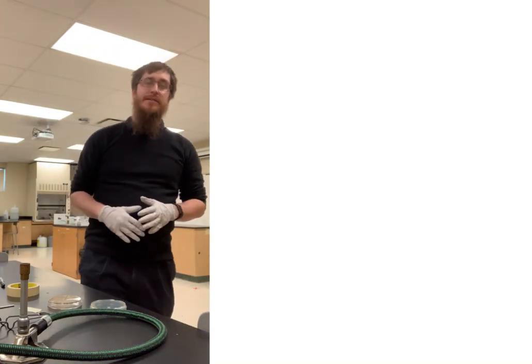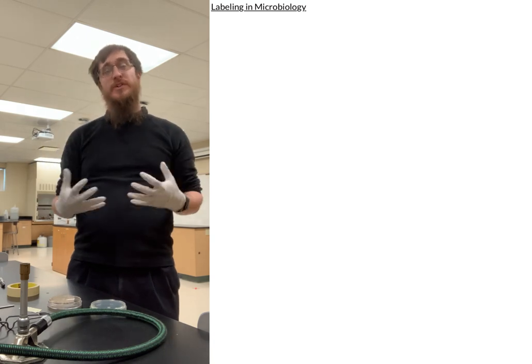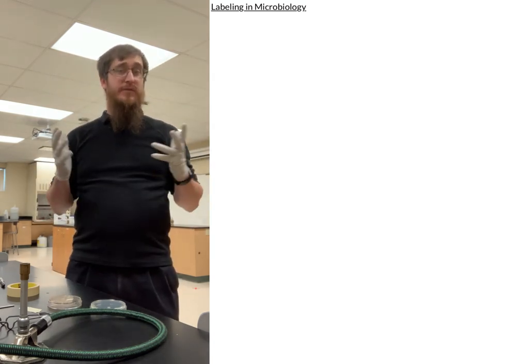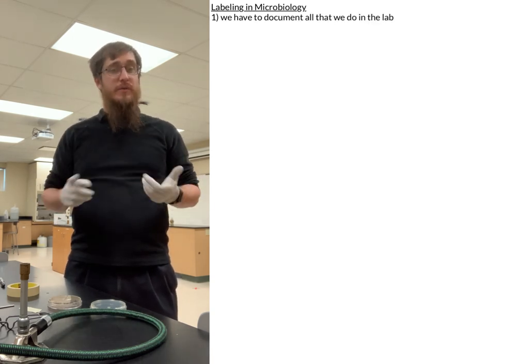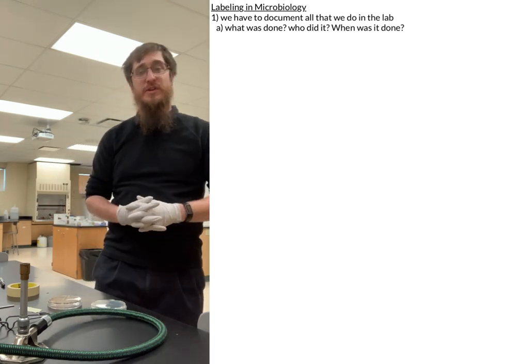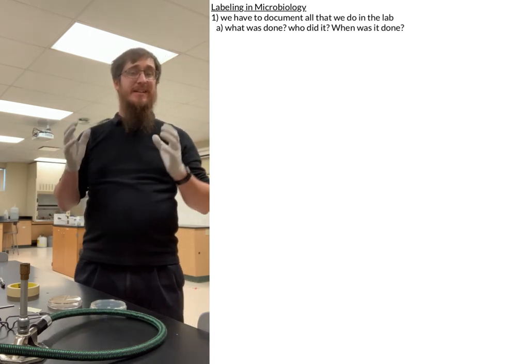Hey everybody! I just want to do a quick little video over how we actually label our materials in our microbiology class. So you may wonder again why we have to label stuff, and the big thing here is just whenever you do something you have to document what you've done, who's done it, and when you've done it. Those are the three big things that we try to make sure we get on all of the items that we complete in the lab.